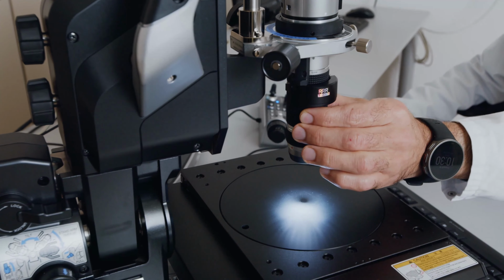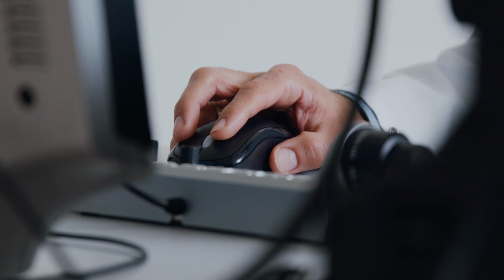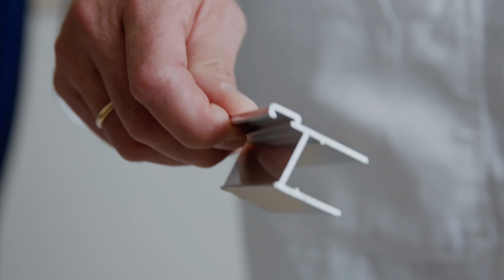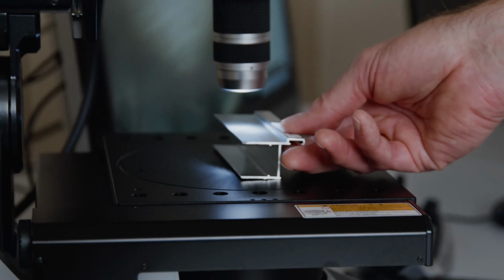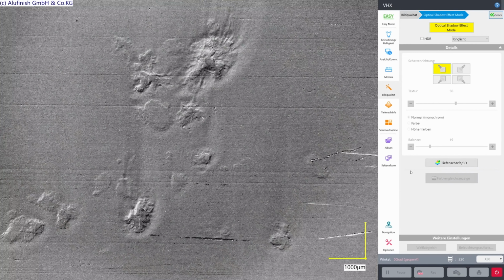Which defect patterns these are, we will see today with the example of 4 patterns. This defect part is a shiny anodized pattern on which clearly recognizable spots can be seen. Clearly recognizable spots under the digital microscope, these can now be examined more closely. The option of selecting the light offers much better possibilities to view the structure of the defect in more detail.